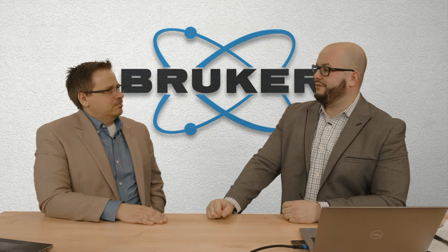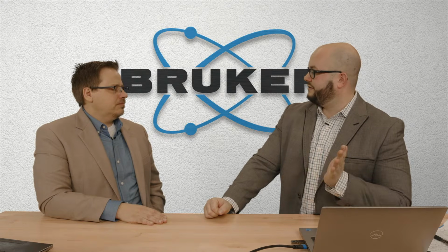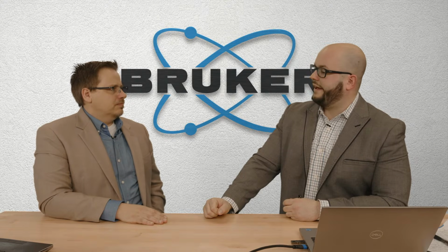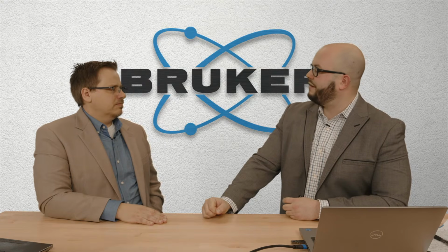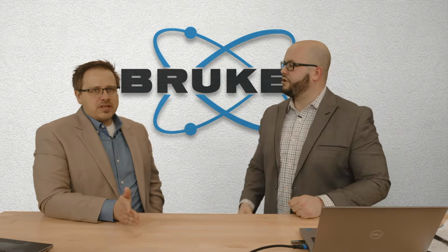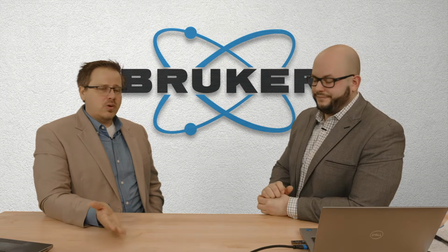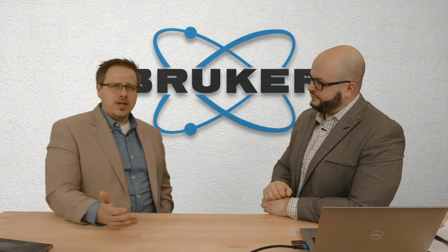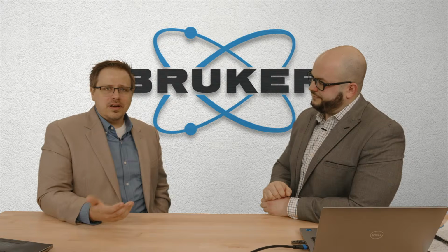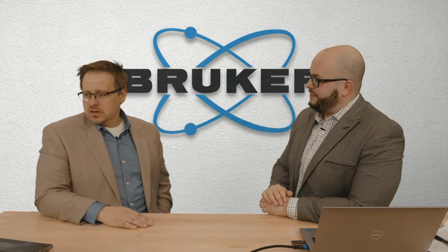But if there's research that's been done on the material, they have tabulated moduli and Poisson's ratio. You could probably get it by looking at references online. The best thing is to search the journals and do a literature search, or find a collaborator who can do theoretical calculations of the moduli. Oftentimes a lot of these thermodynamic calculation and kinetic packages can actually calculate your moduli as a function of alloy composition and structure.